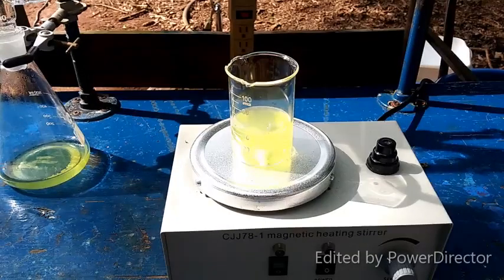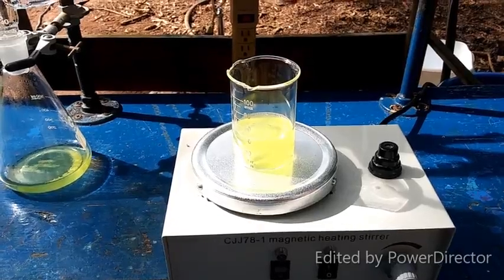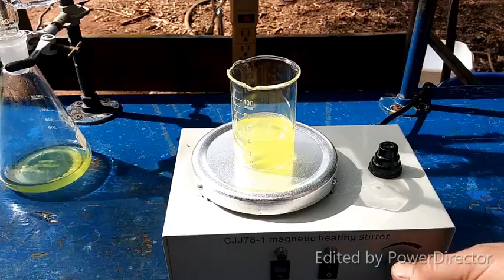Okay, so this has been stirring now for maybe 10, maybe 15-ish minutes, something like that. And you can see it has finally gone transparent. So this is the way that you want it when you're getting ready to start. Everything should be fully dissolved. There shouldn't be any solids left in there. So, yeah, you do have to stir it for a little bit.